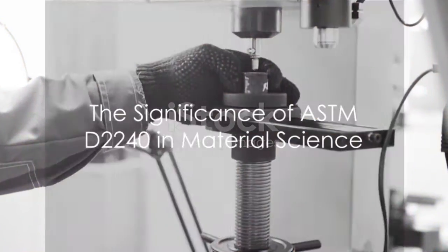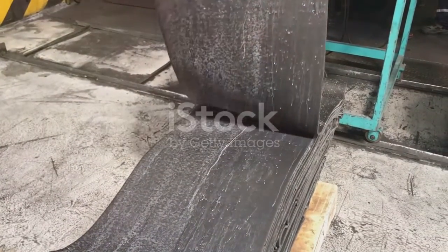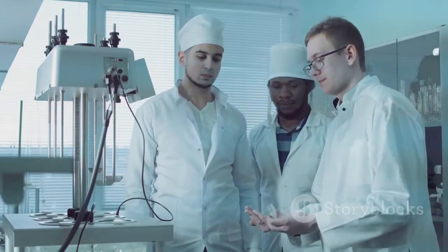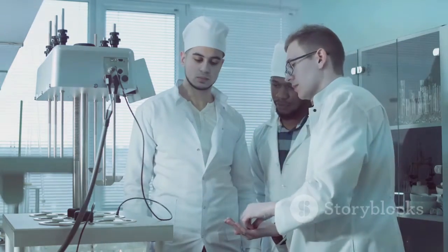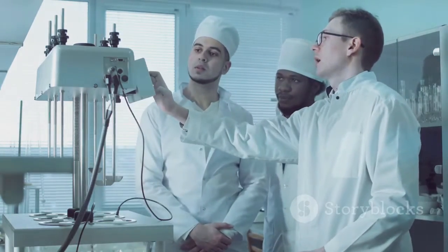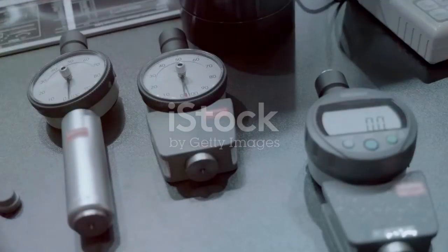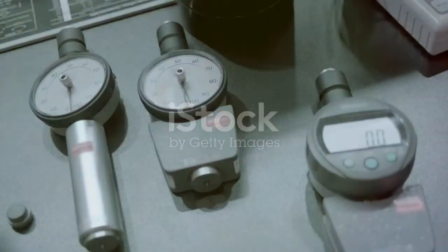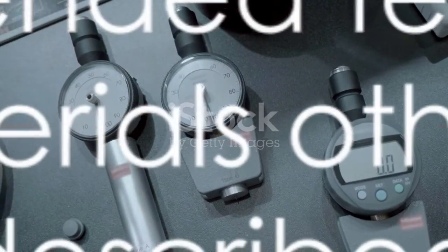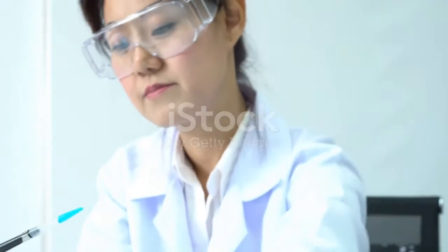In the world of material science, ASTM D2240 is a trusted standard, with all materials, instruments, or equipment used for the determination of mass, force, or dimension having traceability to the National Institute for Standards and Technology, or other internationally recognized organizations parallel in nature. The ASTM D2240 test method is empirical, intended primarily for control purposes. It does not provide a simple relationship between indentation hardness and any fundamental property of the material tested. For specification purposes, it is recommended that test method D785 be used for materials other than those described.